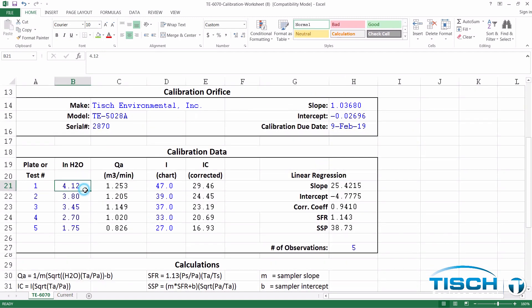Scroll down to Calibration Data and enter the inches of water. Our first reading was 5.10, our second was 3.85, our third was 3.70, our fourth was 3.30, and our fifth was 2.70. Next, enter the corresponding chart readings. Our first reading was 50, our second was 44, our third was 43, our fourth was 42, and our fifth was 38.